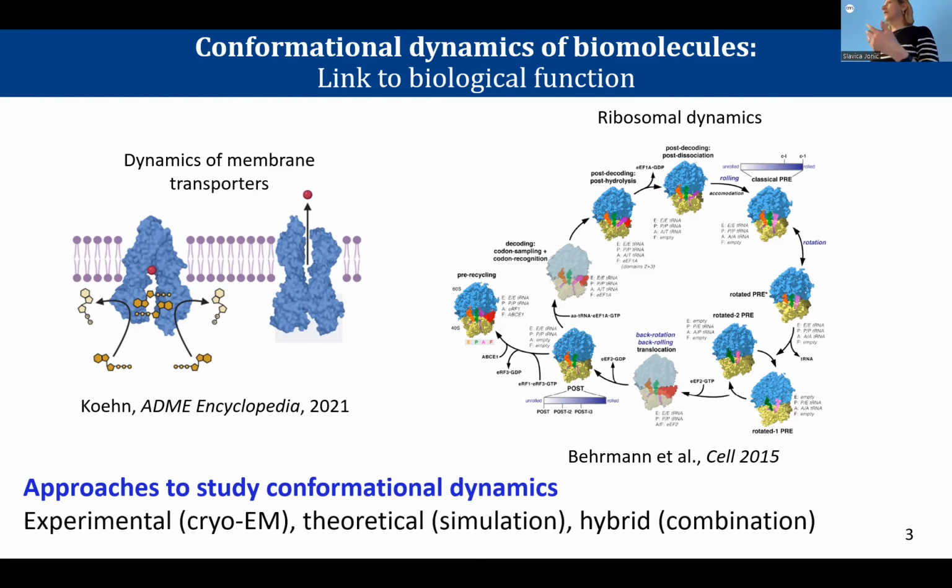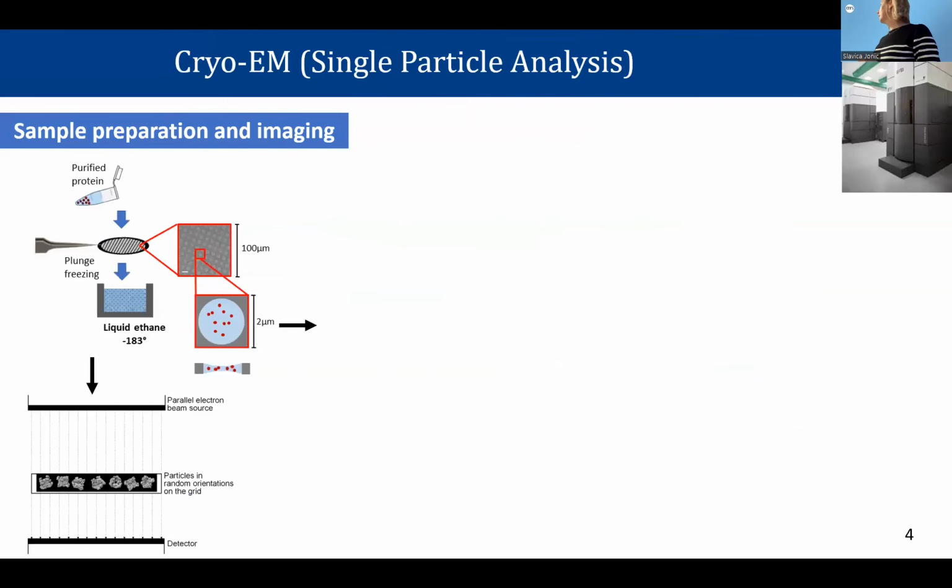We can apply some experimental approaches like cryo-EM, but also there are some other approaches and theoretical approaches like simulation that we will see here, and we can also combine them. So we will focus in this talk on the combination of simulation and cryo-EM data analysis.